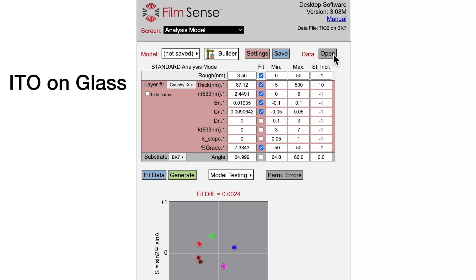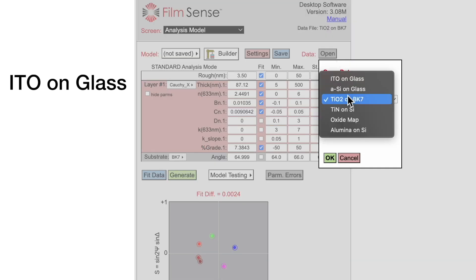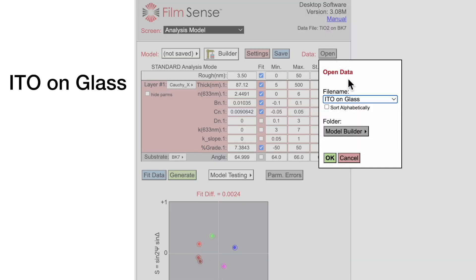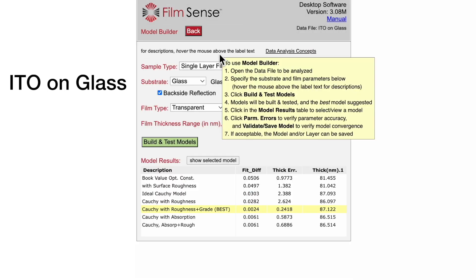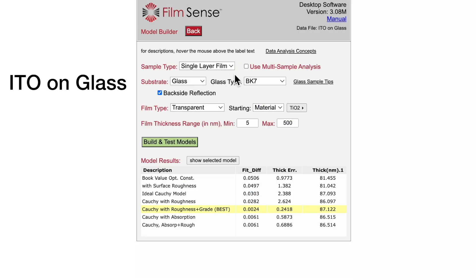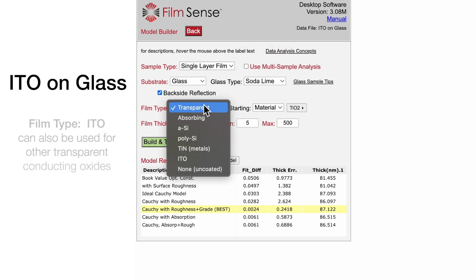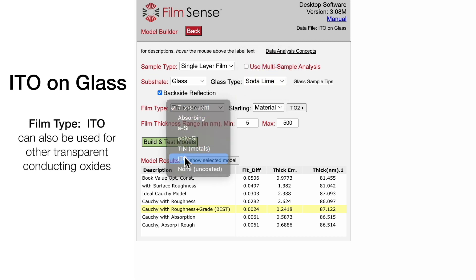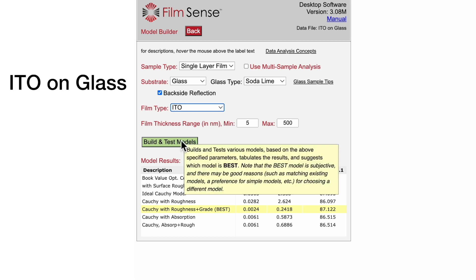Next, we will analyze an ITO on glass sample, which is a very common transparent conducting oxide. For this sample, we need to change the glass type to sodalime, and we will select the ITO film type. Then build and test models.